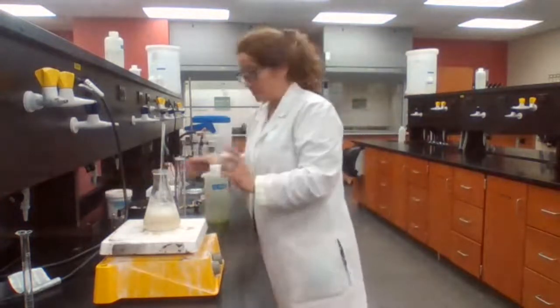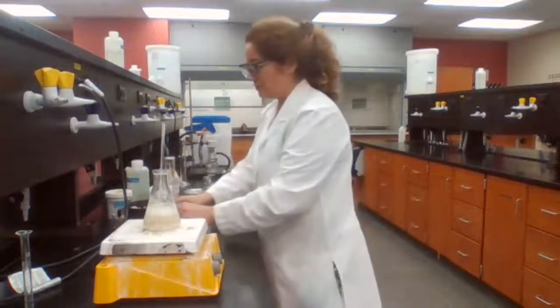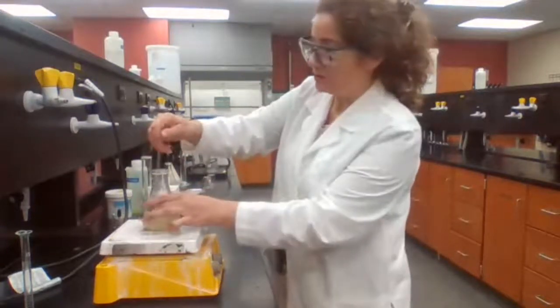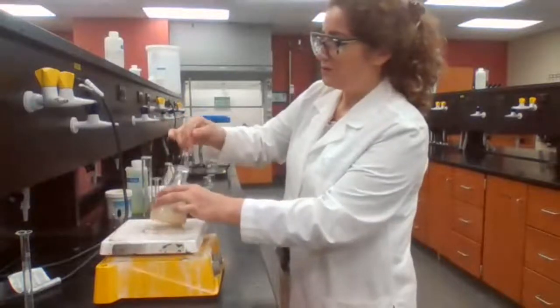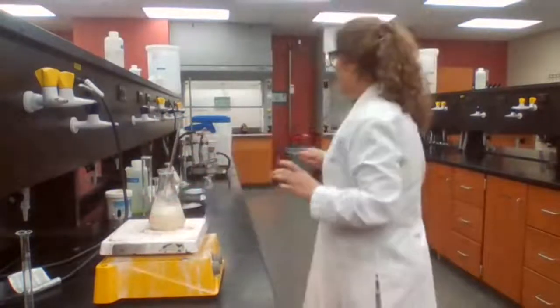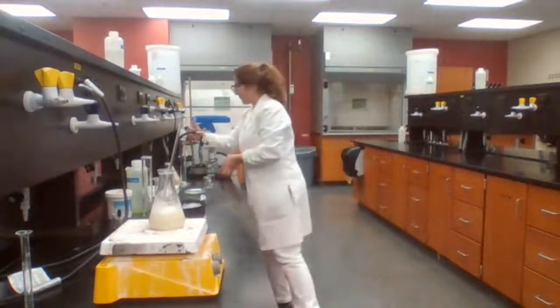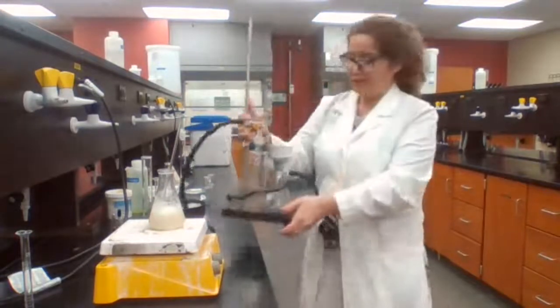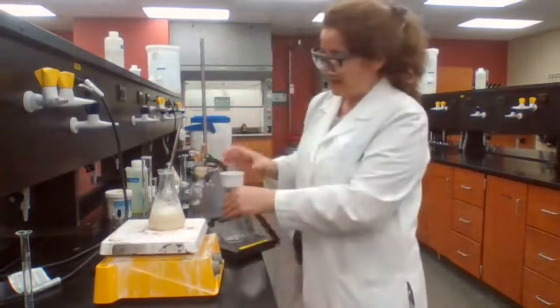While we are waiting for the solid to dissolve and the solution to form, I'm going to talk about the vacuum filtration system that we have.